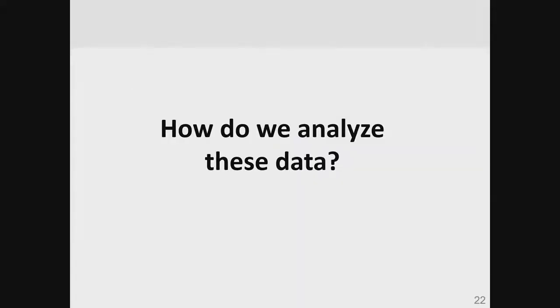Okay, so the key thing here is now how do we think about analyzing these data? I think this is where some of the things have changed substantially in the last decade over the way things had been in the past. One key component is that we don't think about analyzing these data as how many things do we ID. We're thinking, can I detect the peptide? And if I can detect it, can I quantify the peptide? So those are two things. If you just assume, for example, everything's there, can you detect it? Can you quantify it?